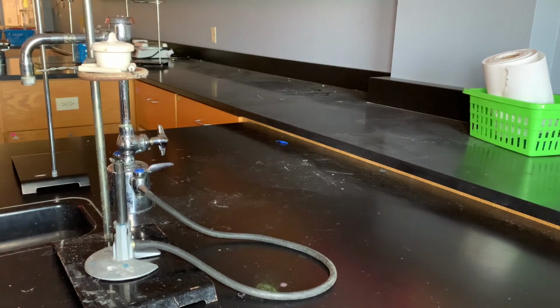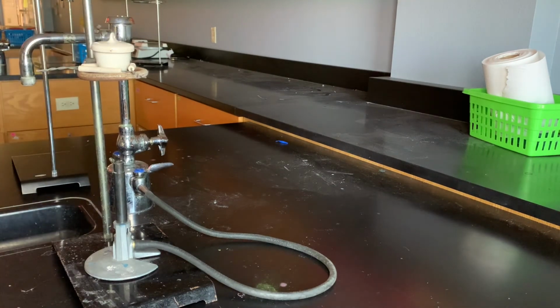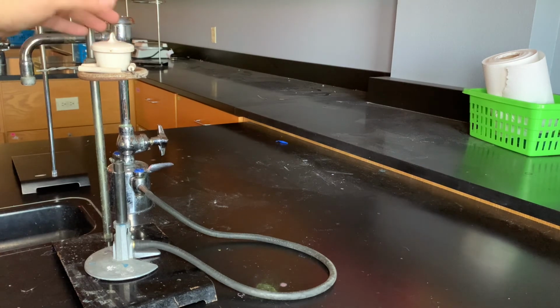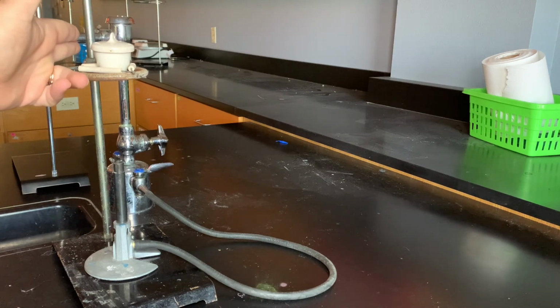So just as before, when I'm doing this experiment, I will have to look in here to see what changes have occurred so I can figure out when I'm done heating. Once I get it all done, I can leave it here to cool, which is probably the best thing for you, or I can put it on the table. I'd recommend just leave it there, and the way to check to see if it's hot enough or cool enough, you should be able to bring your hand around and you'll feel if it's still warm. Just from like this distance here, I can still feel it's warm.